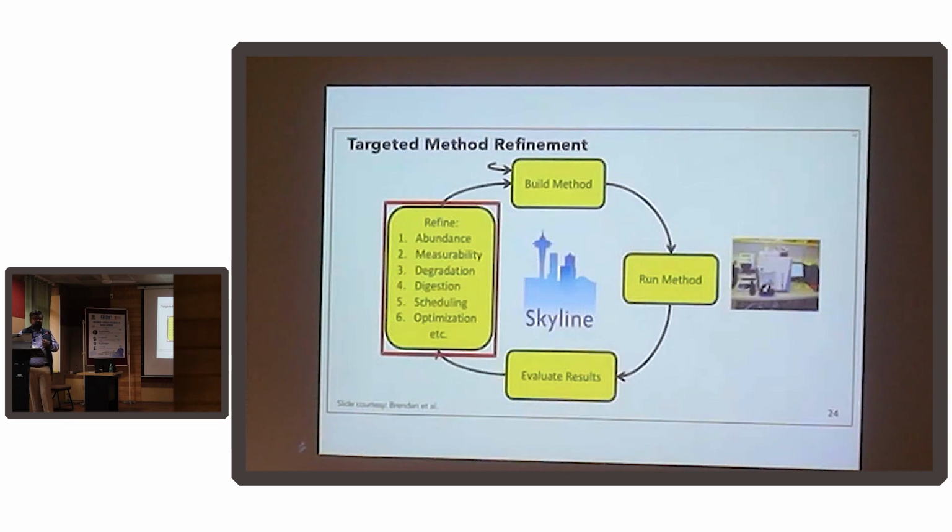Discovery is quite easy. You go through trypsin digestion, you clean up the peptides, and then you allow mass spec to do all the rest. When you want to do a targeted approach, it is fairly difficult. The reason is that now you have to refine and specify that this is the peptide, but since they are difficult, they are very precise because you have spent a lot of time optimizing.